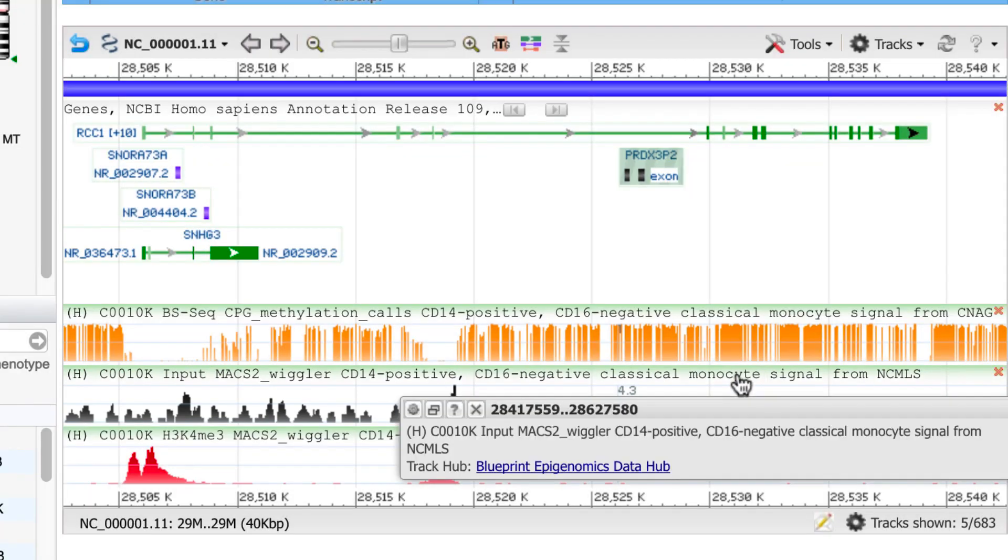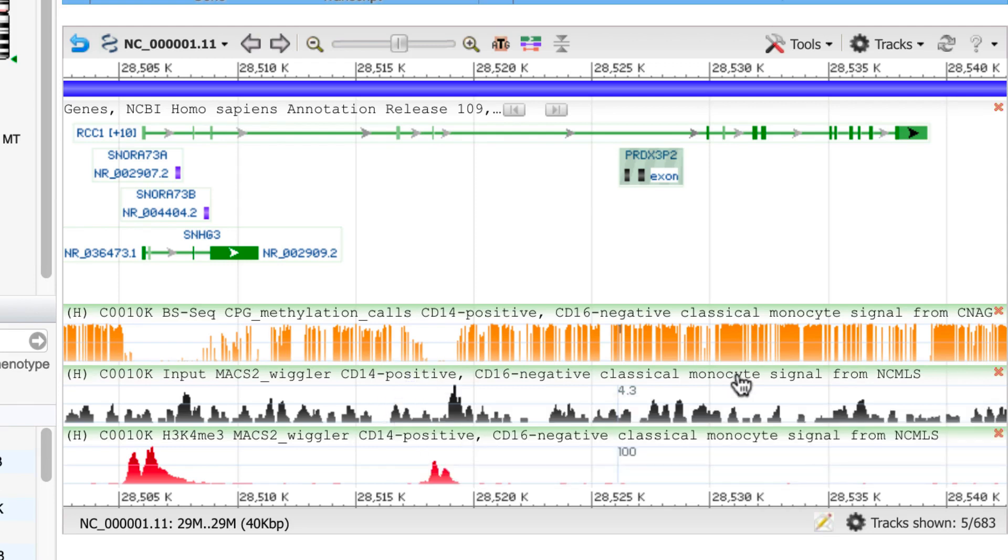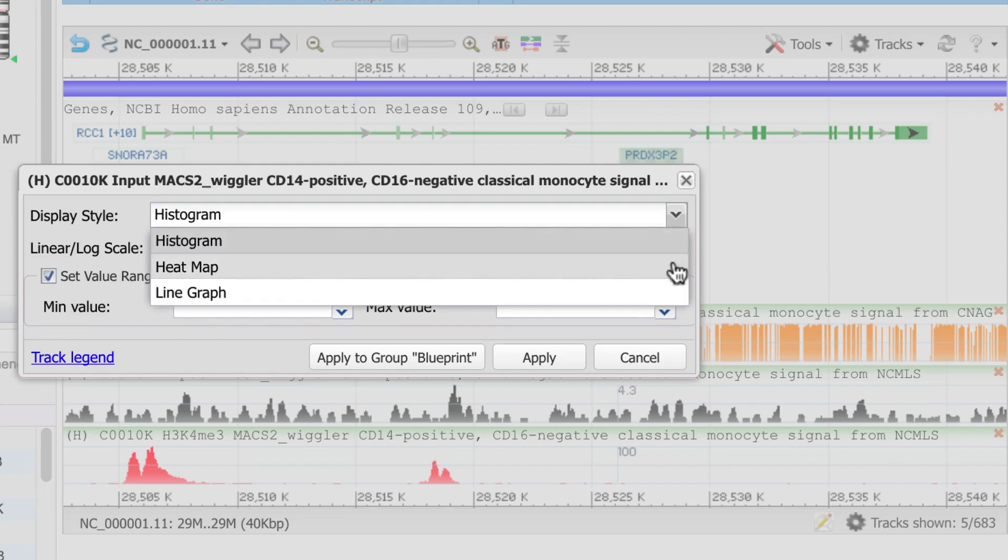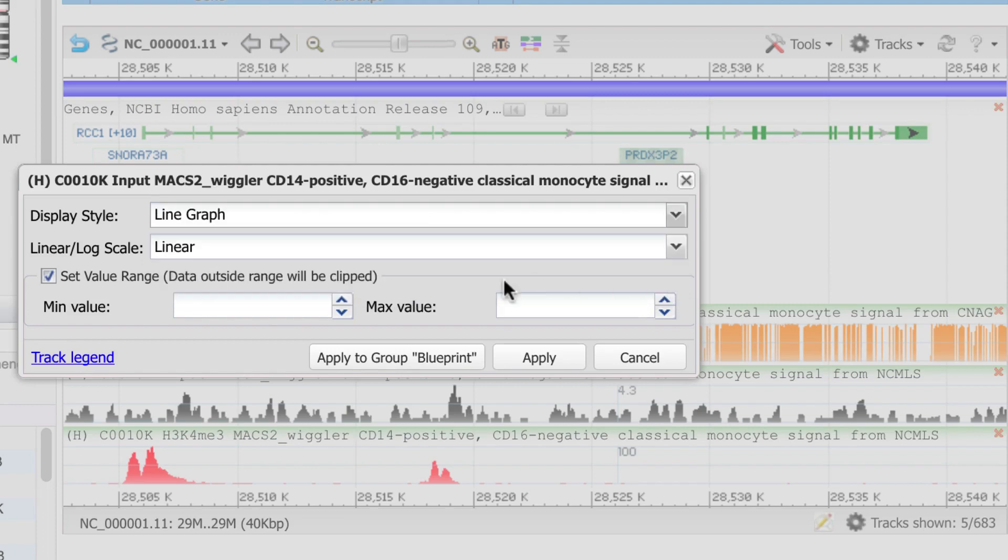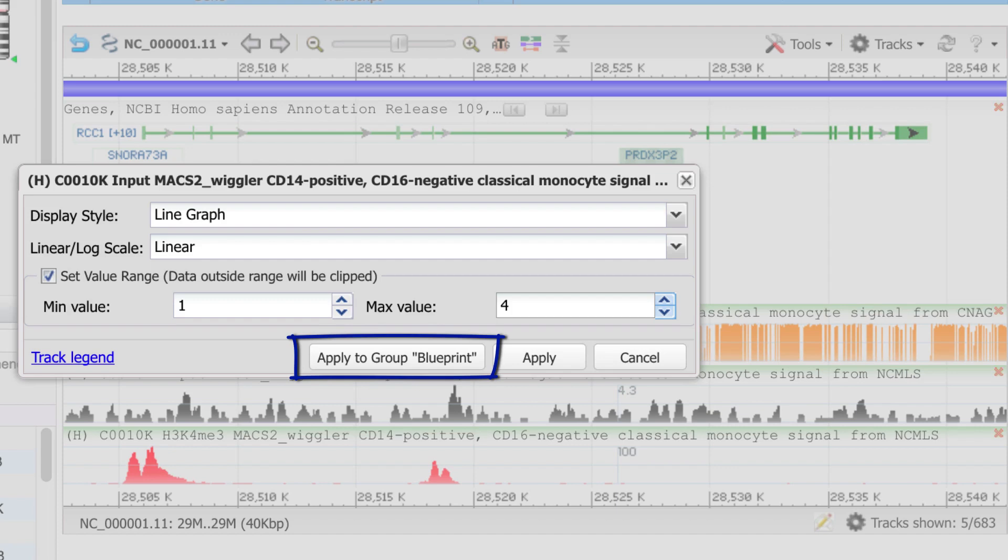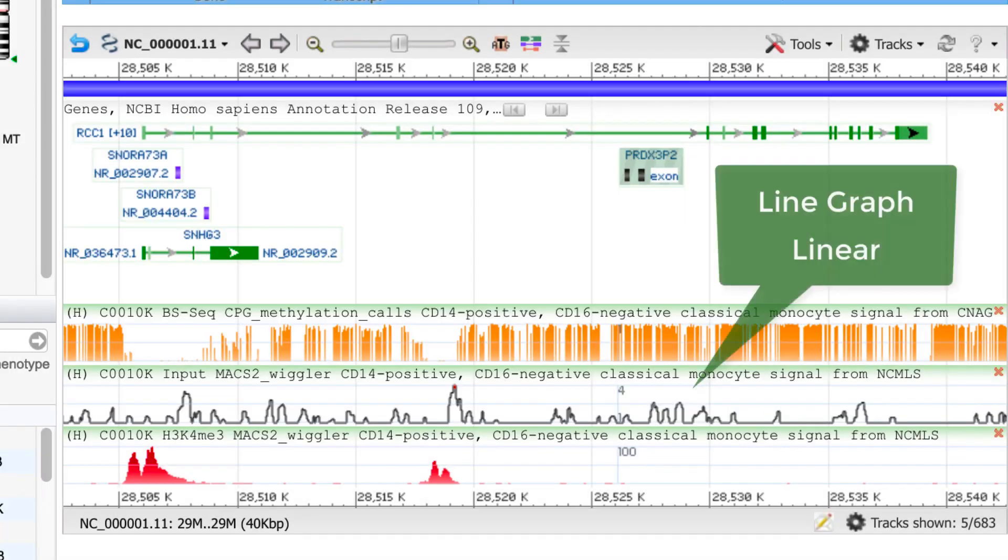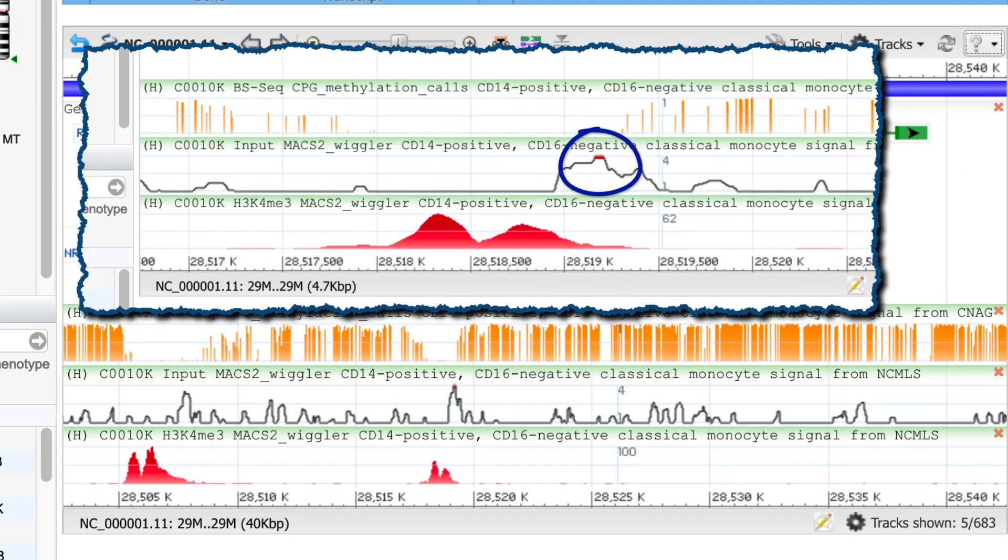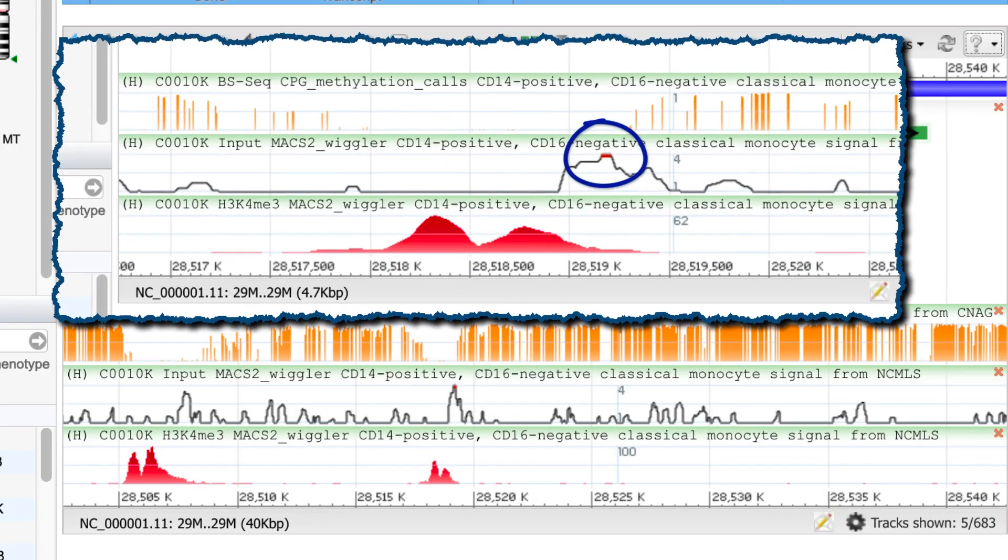Click on the track name, or you can also just hover on the track name, then click on the gear icon in the tooltip menu that appears. I'll change to a line graph and set the value range from 1 to 4 for this linear scale. Notice that this menu includes the option to apply these settings to the entire Blueprint group. We even indicate where the data have been clipped in the newly set range. Note the red region.